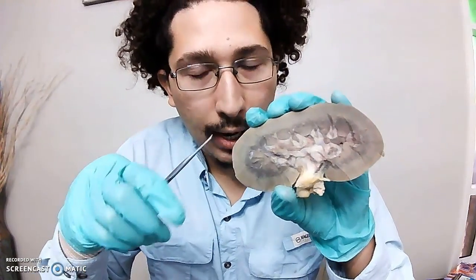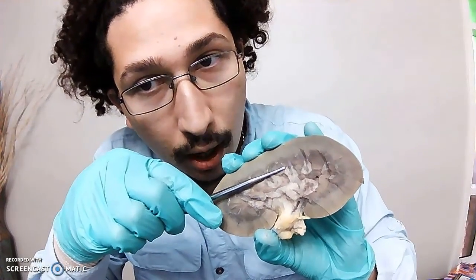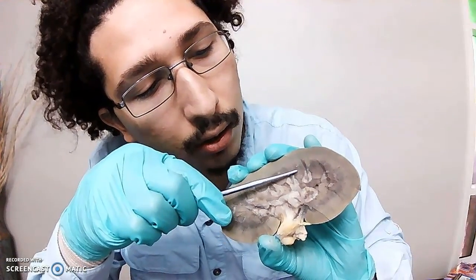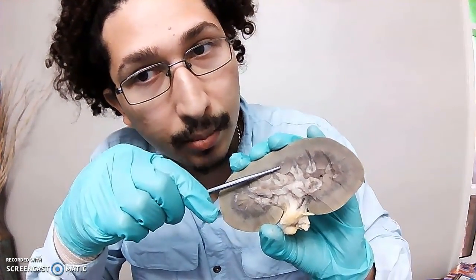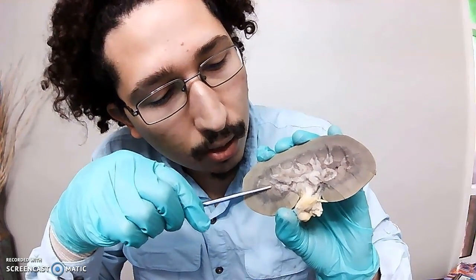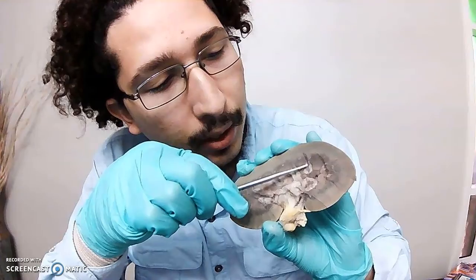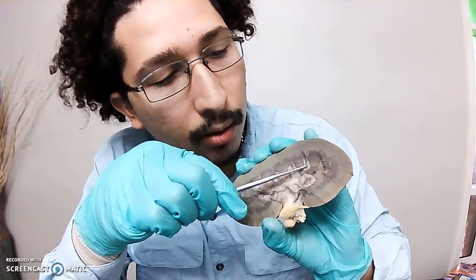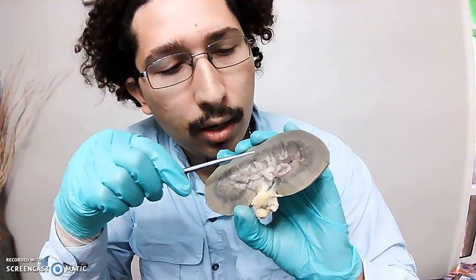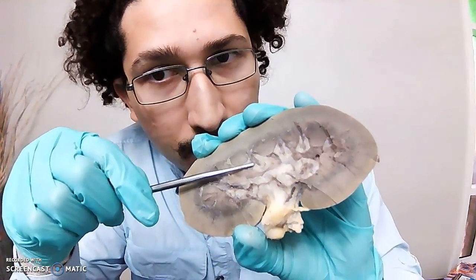Inside of that renal medulla layer, we have a bunch of different structures. These upside down triangles are called the renal pyramids, because, hence, triangle, upside down triangle, renal pyramids. Laterally to each renal pyramid are the renal columns. Inside of these renal columns are an assortment of structures, blood vessels, and other stuff ingrained in here. You can see tiny little blood vessels here if you really look hard. It's hard to see on the video.